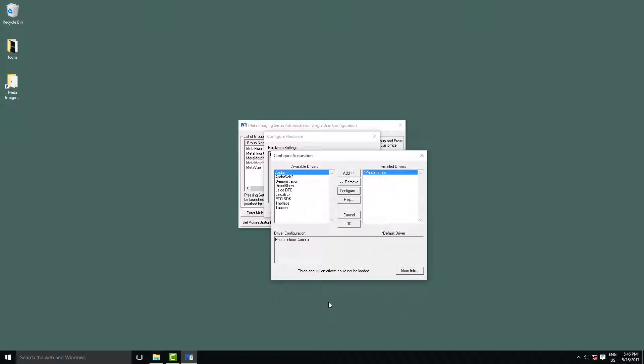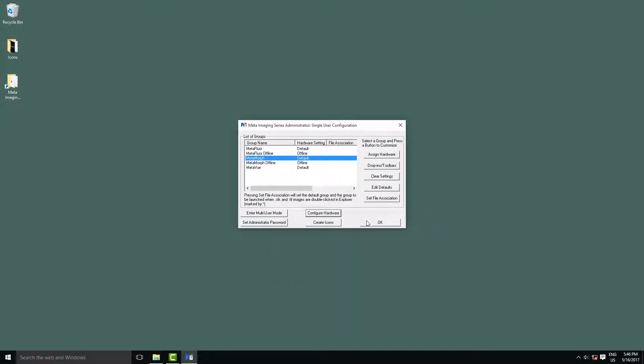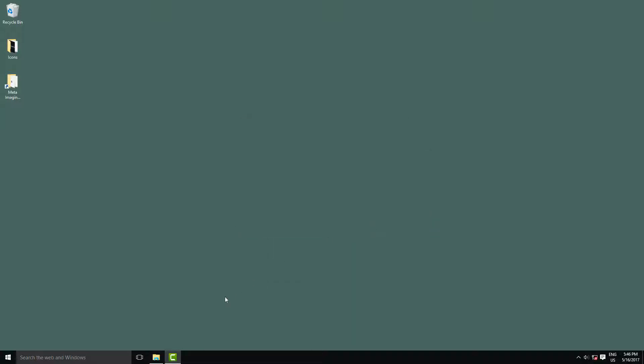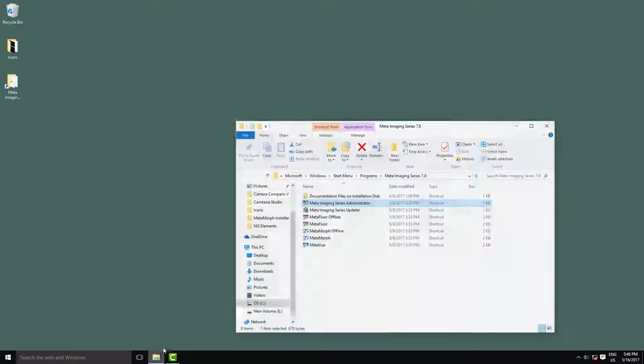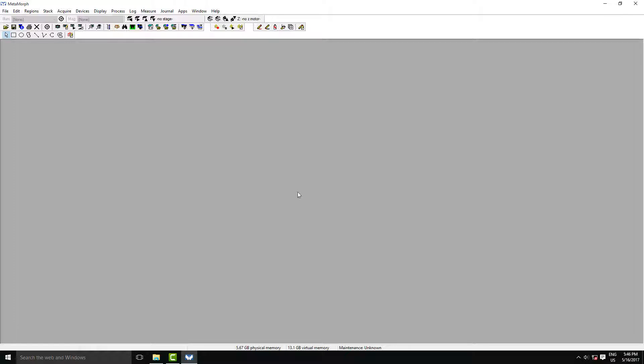Click OK, and now we're basically done setting up the camera. Now we'll load up Metamorph, and I'll just run you through a couple of the settings that you should always change when you've started up the cameras.